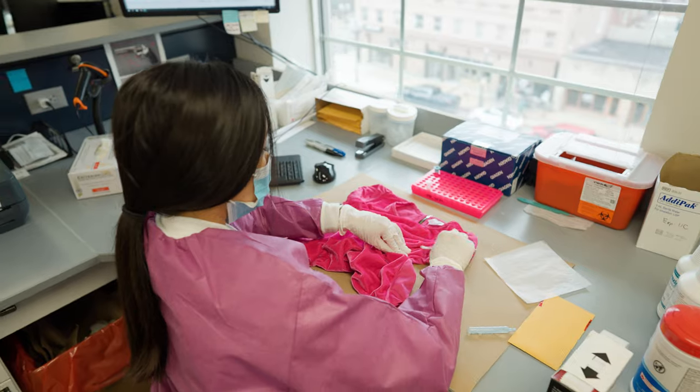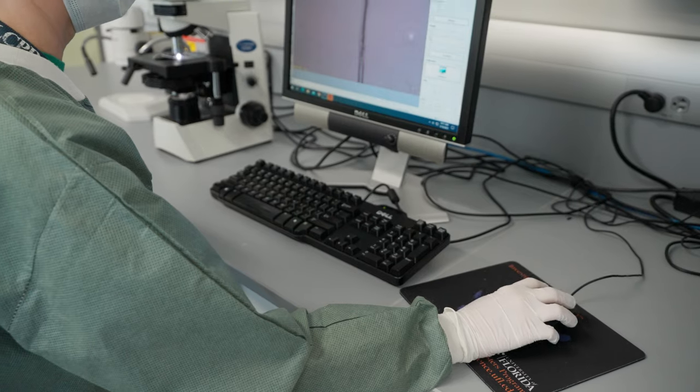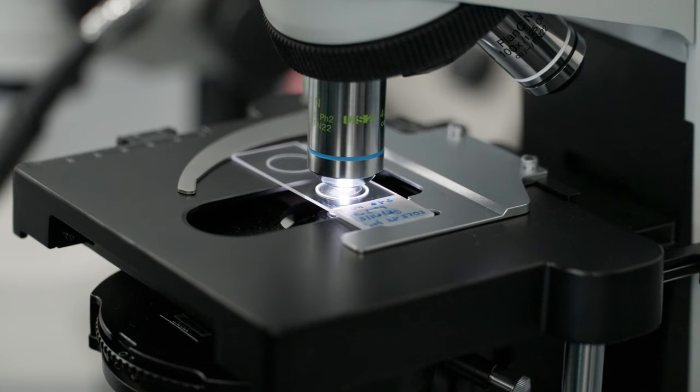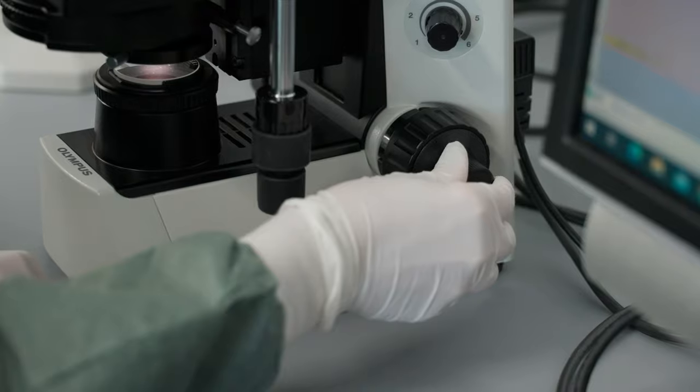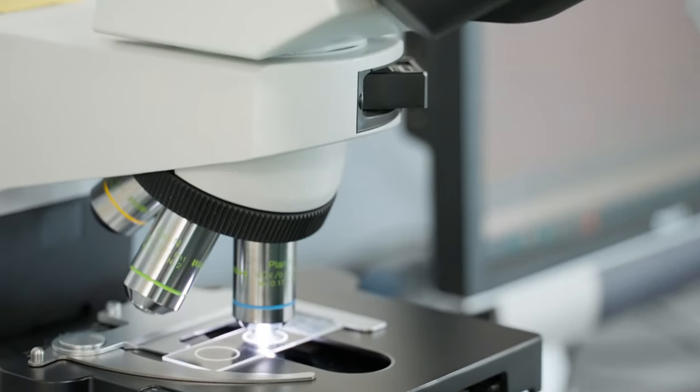After the biologist finishes the work in the actual laboratory, a biology report is written and if the case included evidence that needed to be tested for body fluids, then that report must be reviewed by another biologist for quality control. The biologist also may be needed to testify in court about their findings.